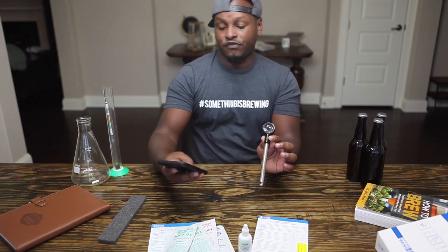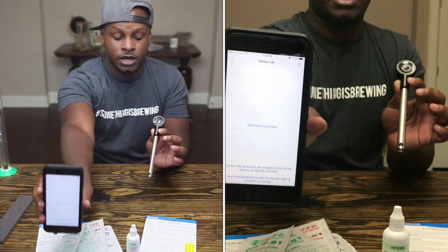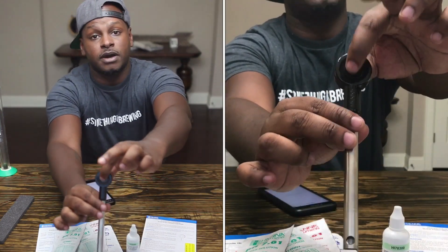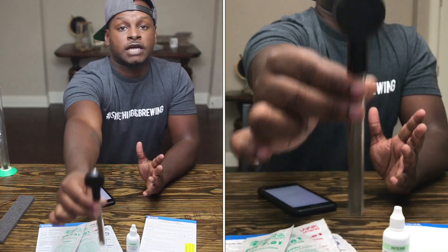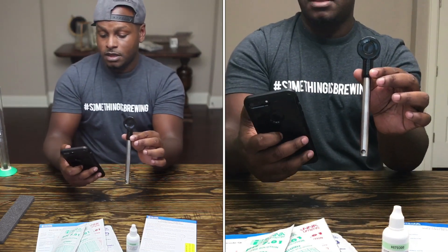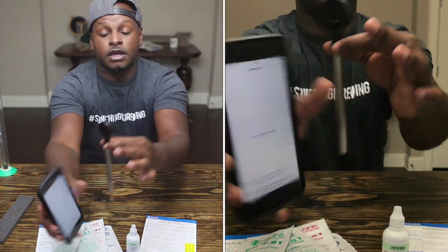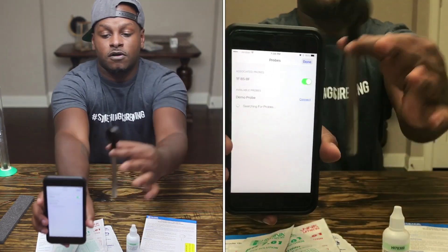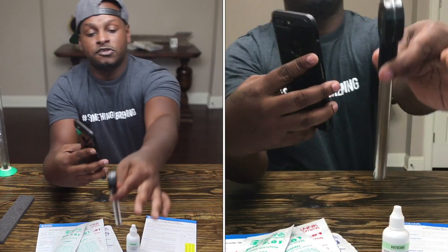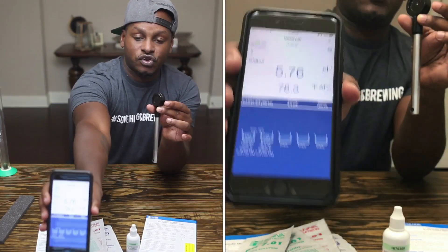It's all controlled via Bluetooth for your readings and comes with an app. I have an iPhone so it may look different than on other phones. To power it on, just hold the center button — the halo will blink blue to let you know it's ready to sync with your phone. Tap the Bluetooth link in the corner of the app, slide the bar to green, and you'll see the blinking slow down, indicating you're connected.